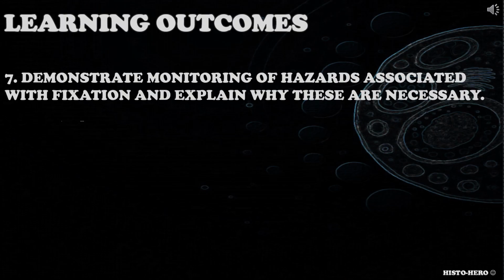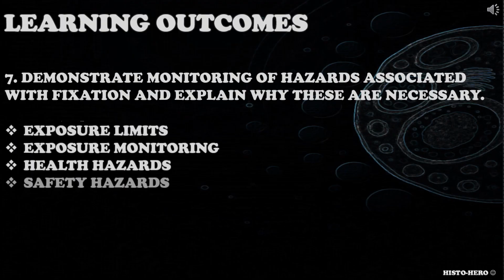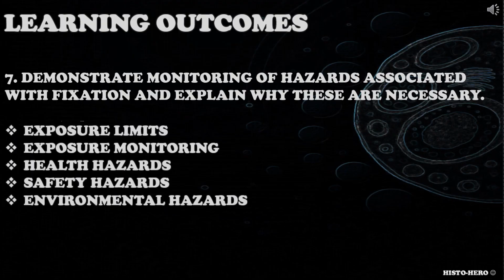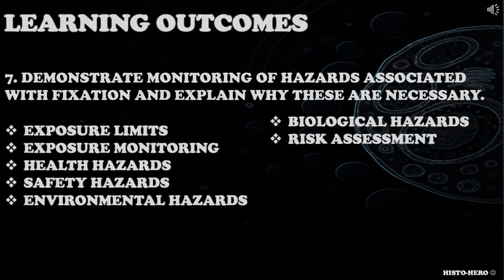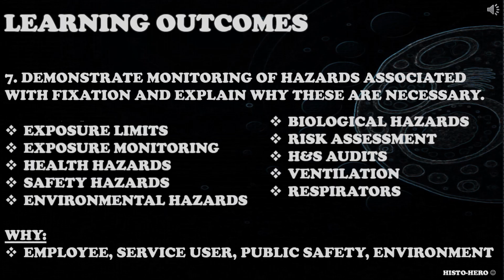Candidate could consider different types of fixatives, their exposure limits, monitoring of exposure, health hazards, safety hazards, environmental hazards and biological hazards associated with fixation, risk assessments, and health and safety audits to assess hazards, use of ventilation or respirators to minimize exposure. Reasons why they are necessary to monitor like employee safety, service user safety, public safety, environment safety.